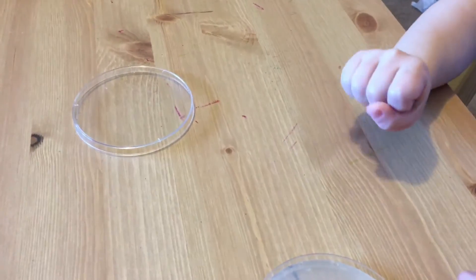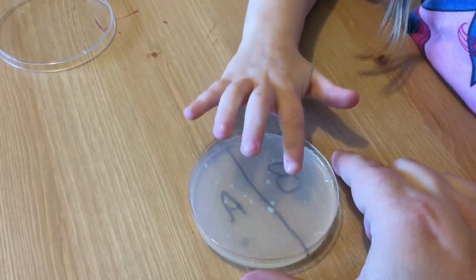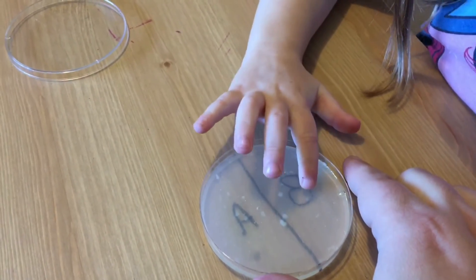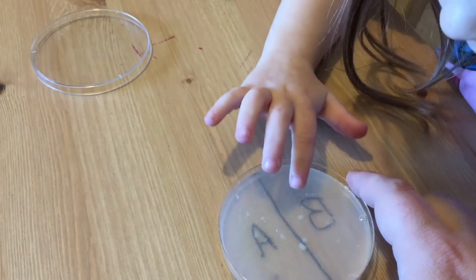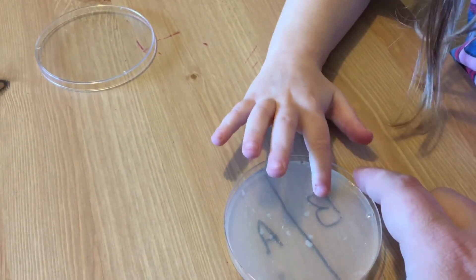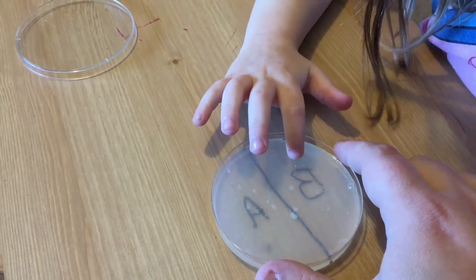All right, now that we have washed our hands thoroughly, we are going to take our clean hands and we are going to rub them on the B side. So go ahead Carmen and gently rub on the B side. Yep, gently, gently rub. Nothing's gonna happen yet. You're just gonna rub on the B side.